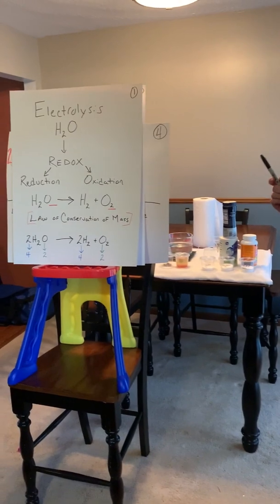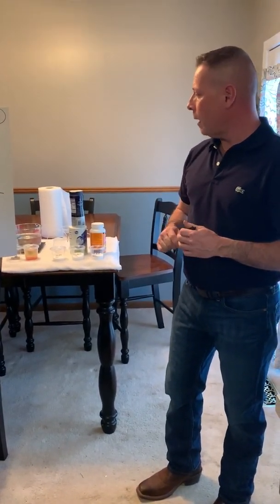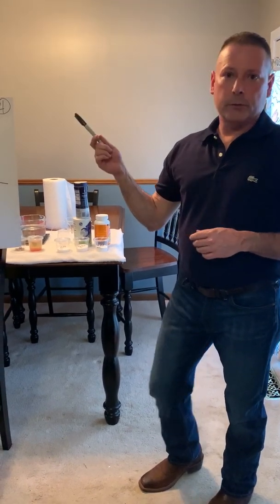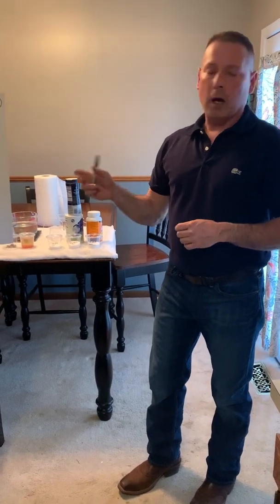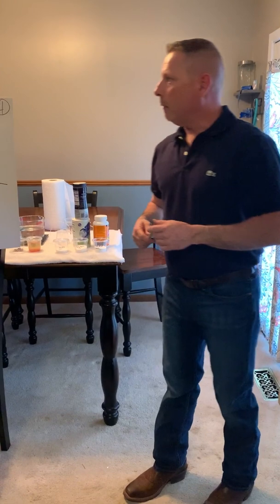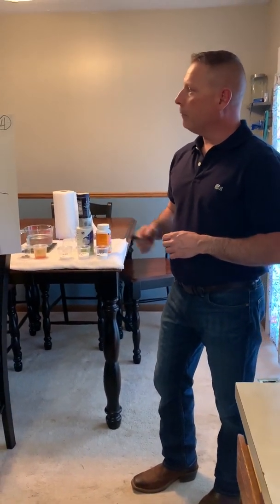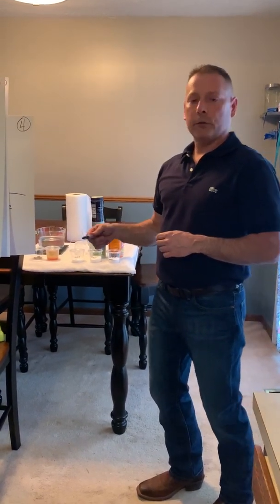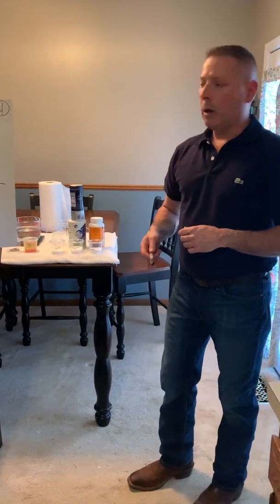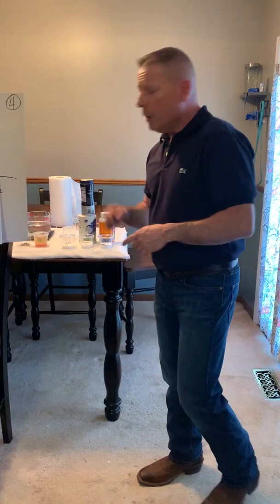I always have had an interest in electrical applications, and this one in particular involves the electrolysis of water, which is breaking apart the hydrogen and oxygen atoms, turning them into hydrogen and oxygen gas. I think this is a very efficient process, and it's going to be very beneficial to our planet when they find a more suitable power source, a greener power source. Once they do this, it'll help with the greenhouse gases. So let's look at the lab.